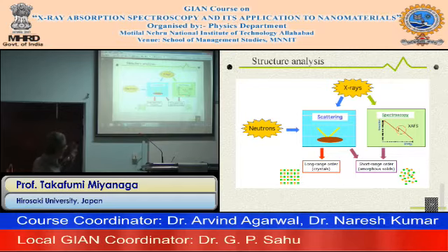For example, the excited X-rays tuned at the edge. So another scattering information is coming. And from the neutrons, neutrons interact with the magnetic system directly. So there are several branches of the material science, but a more simple picture is summarized like that.